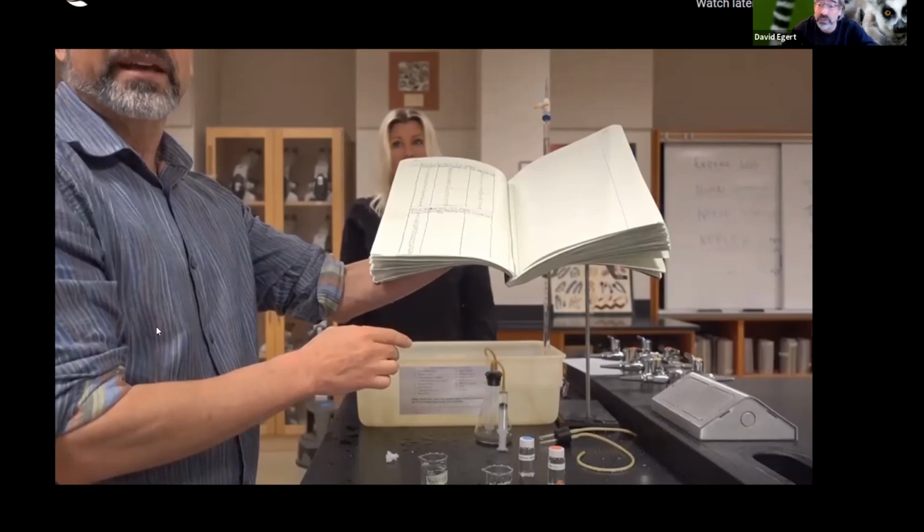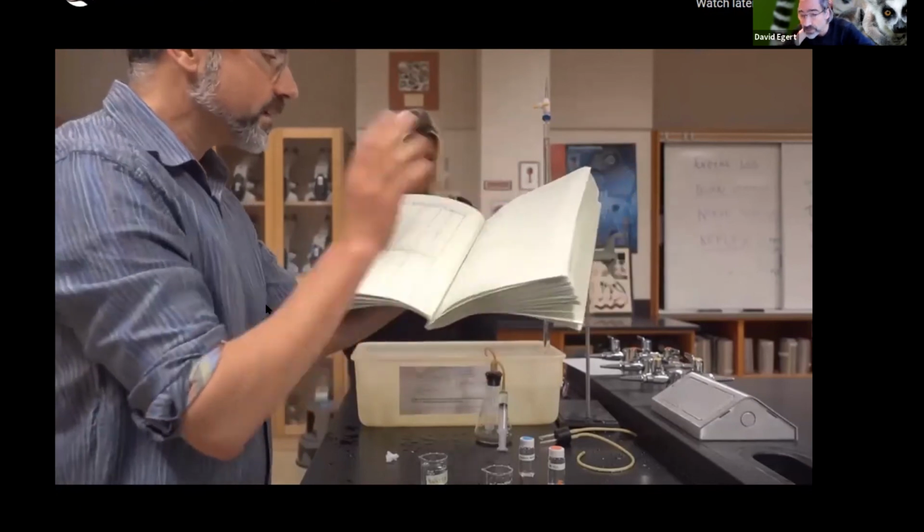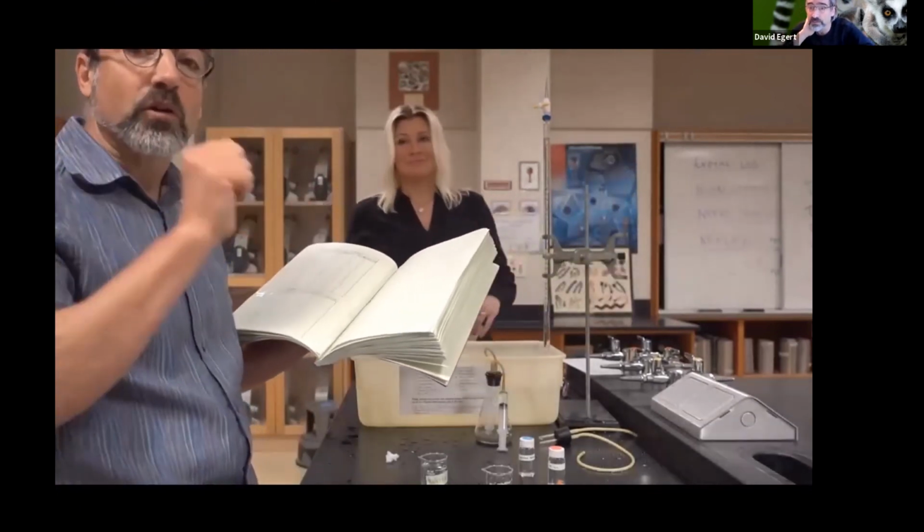The data we're going to give you is going to be the water level. So the first step will be to convert that into mils of oxygen, which is just 50 minus whatever the water is. Calculate in my lab notebook. So normally we'd have somebody recording that well.